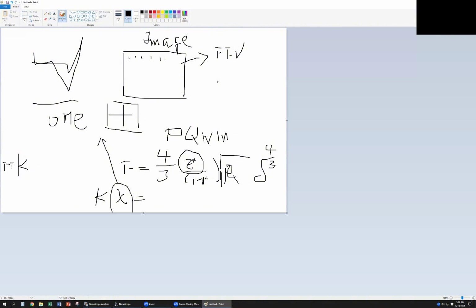The force is equal to K times deflection sensitivity times vertical deflection. So that means this deflection sensitivity, this coefficient number, we must know before we calculate this one.